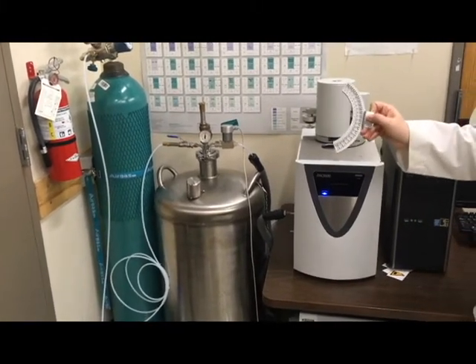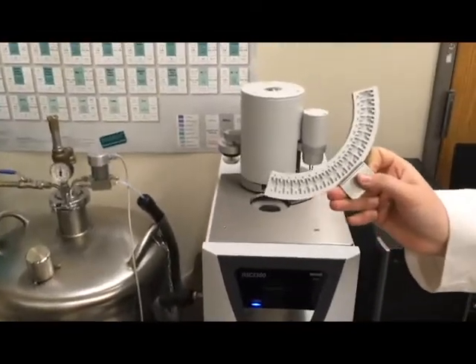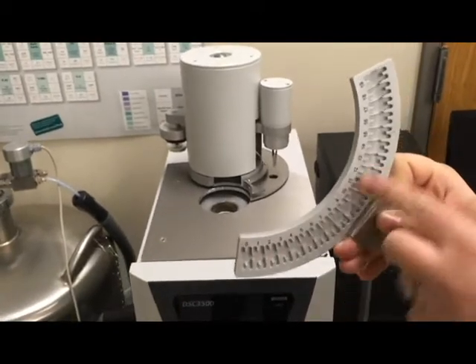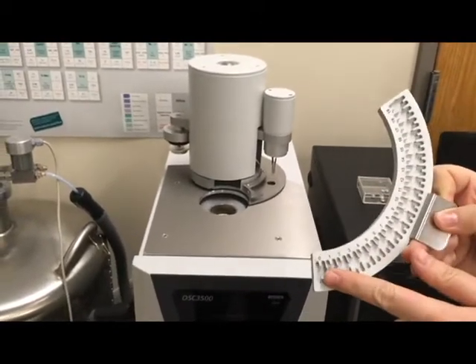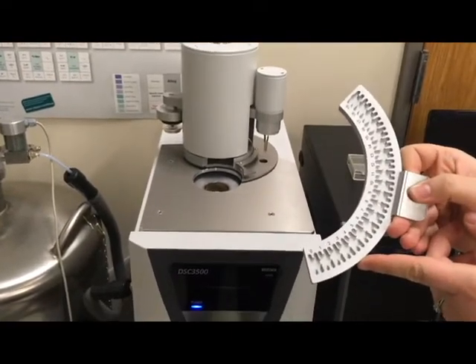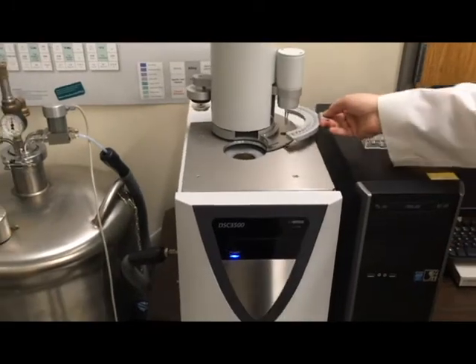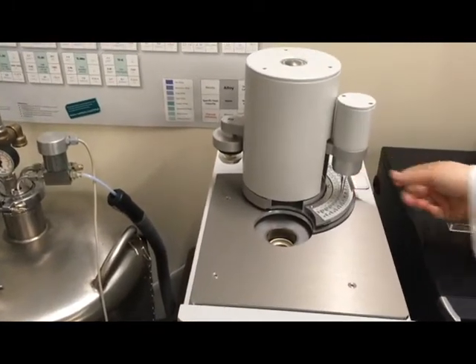This right here is the sample card for the auto sampler. It holds a zero or reference space all the way up to 19 different samples. We're going to take this over to the sample prep area, put our crucibles onto it, and then bring it back and place it back on the auto sampler.